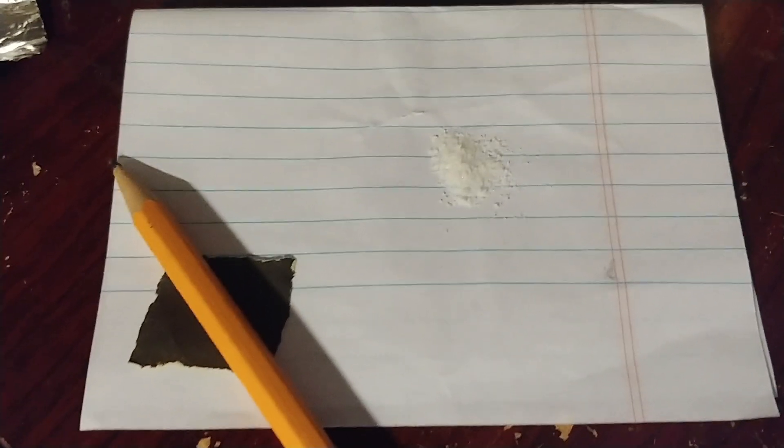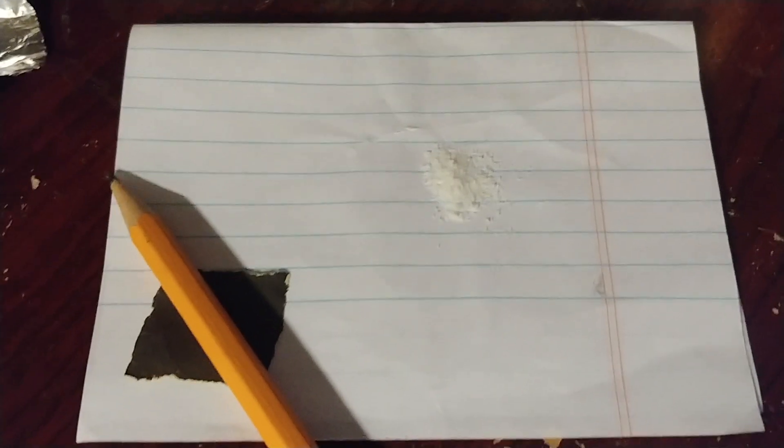It's one of the most common lab accidents, especially for home chemists, that result in finger amputations. And it can be immediate amputation - this isn't like you've devastated your finger and the doctor has to act. No, you can blow off your finger with just a small amount, and I'm guessing half of this pile could do a tremendous amount of damage.